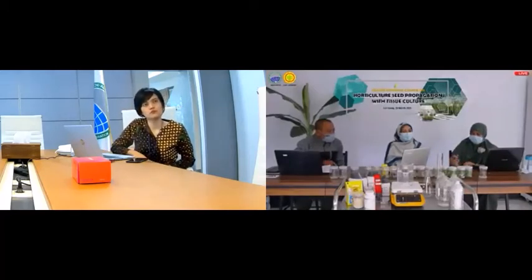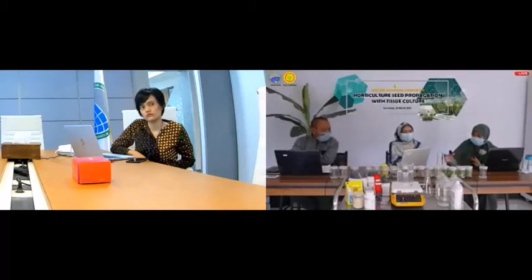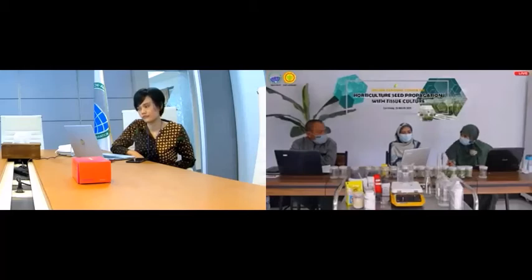Another plant such as orchid, apple or pineapple could need other requirements for the media and also the sterilization method. So we need a lot of trial and learning. When we found this method for banana, it took a long research time to create the exact composition of the media and how we sterilize all of the explants and the tools.